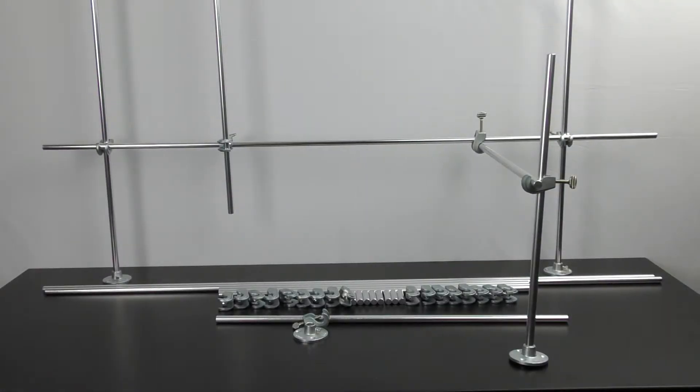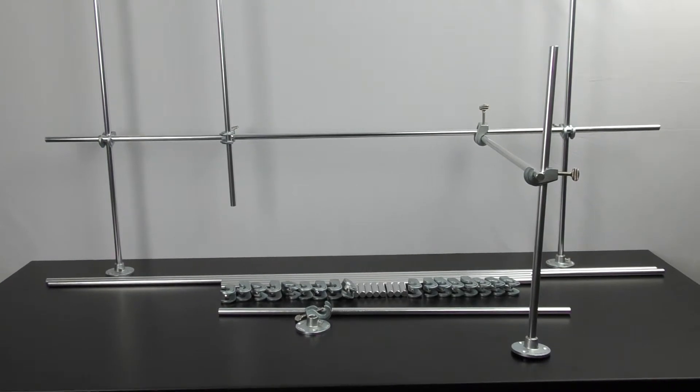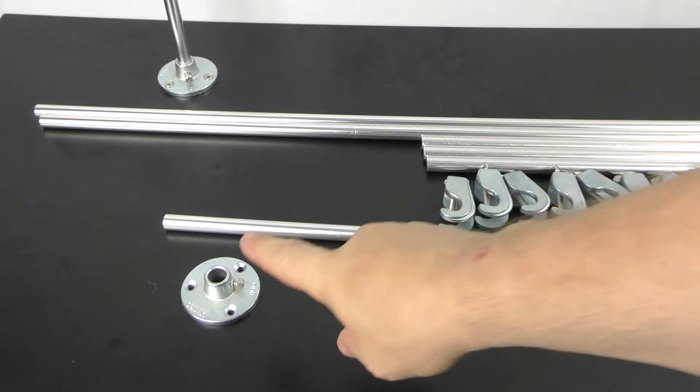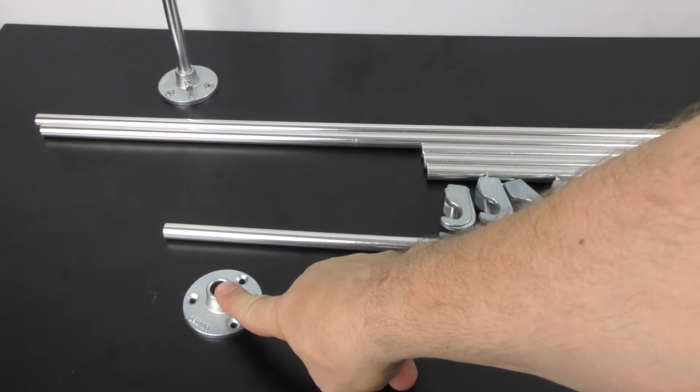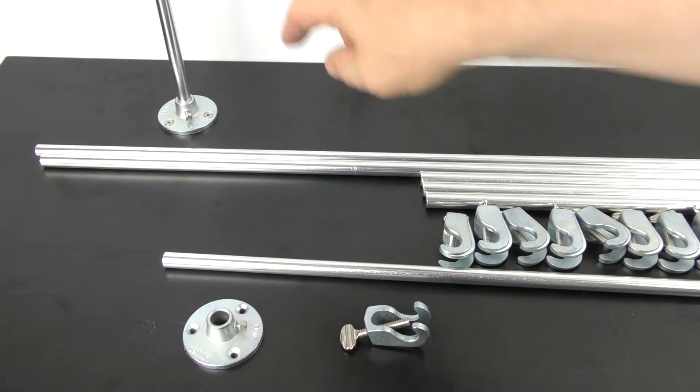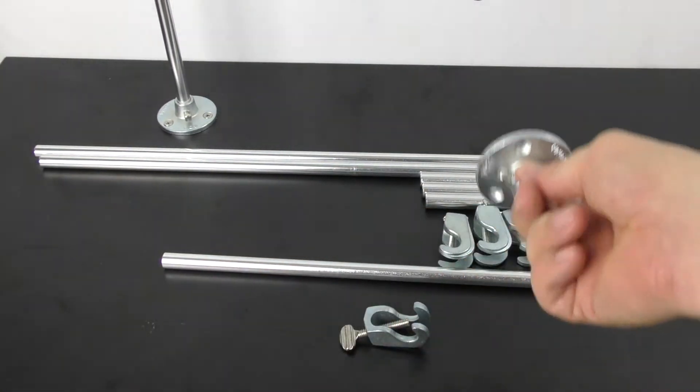The great thing about this system is the simplicity of the parts that are involved. The three basic parts are the footer, which can be mounted to a tabletop, as I've done here, or you can also mount this directly to the wall.